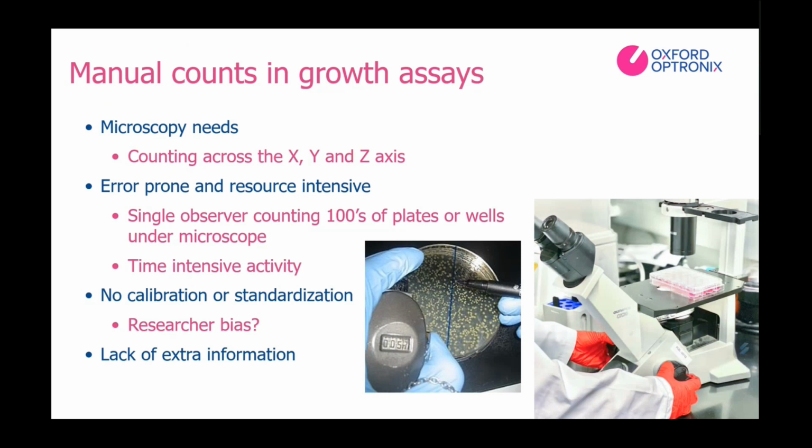Okay, so let's compare these counting methods just a little bit here. So first, for manual counting of organoids, it can most often be summed up like this. A well-trained researcher under a bright field microscope finds an object and then determines if it's an organoid or not. If it is established to be an organoid, the researcher then needs to ascertain if that organoid meets the minimum size requirements. Again, if it does, then one is added to the running total and the researcher moves to the next object. Now, this next move, though, needs to be extremely systematic as not to risk recounting previously counted organoids, and the process is repeated for every object across every well and plate.